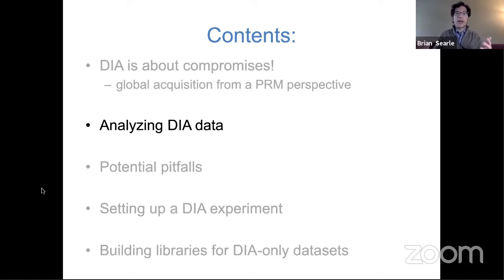But one of the reasons why I think precursor intensity integration isn't as sensitive typically is because of that competition between the ion that you're interested in and other more abundant ions that are being acquired at the same time, especially when you think about only being able to use, for example, an Orbitrap, where you can only put in 1 million charges into the Orbitrap before you end up with space charging effects. These types of issues make it much more complicated to fill with the ions that you're actually interested in measuring. So this seems like a good spot to go back to thinking about analyzing DIA.